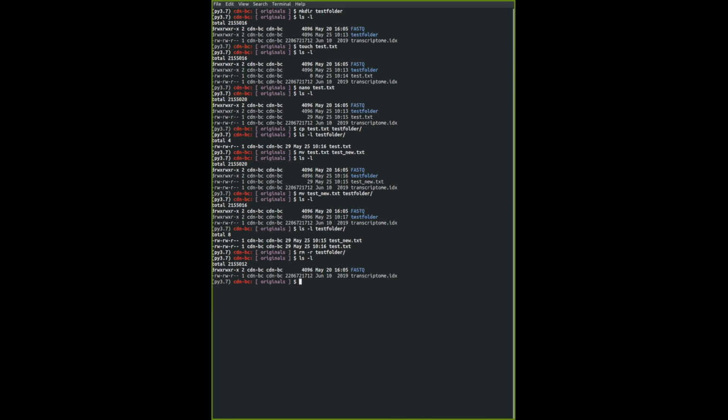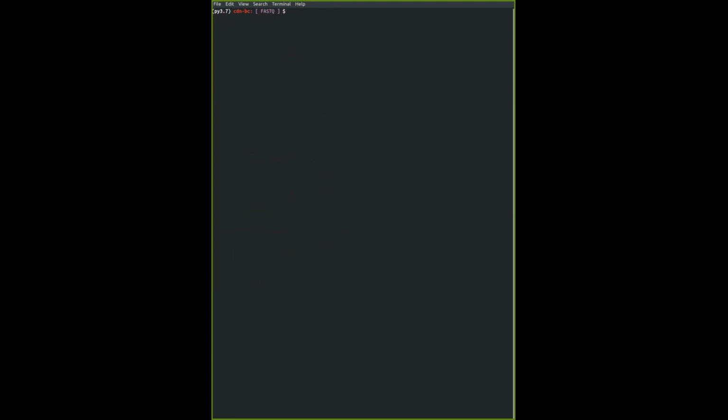And then we learned about some commands which we can use to play around with FastQ files. So I'm going to go into FastQ, and I'm going to clear the screen just a little bit. Again, don't worry if you can't follow this. You don't have to follow along, I'm going to paste this whole code in a bit.